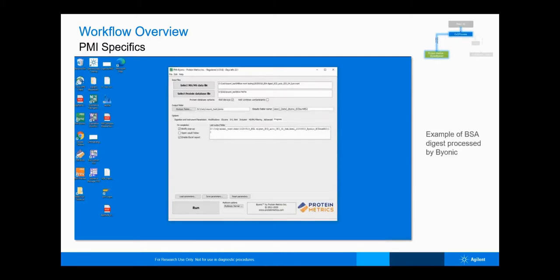So I have a quick video here just to demonstrate how this would work if you're new to Protein Metrics. Now you'll see it's fairly straightforward. We'll select our MS data file and define our FASTA file. We can add things like decoys and common contaminants. Then we have our standard matching parameters, obviously in this case ECD and ETD. We can add in PTMs and glycans that we might be interested in looking for. Can also select some FDR cuts if we desire, and then go ahead and run that file.